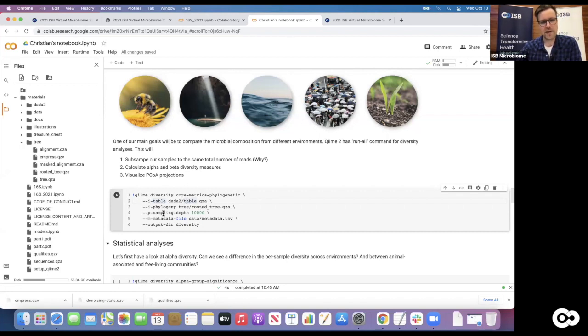And it will ask us for something like sampling depths, and that's a bit weird. That is related to the questions that people were asking in the chat. The one problem that we have is, if we look, for instance, at alpha diversity, let's assume we have one sample, and for some reason, something didn't go quite well in sequencing, and we got maybe only 100 reads for it. If I have a really low abundance organism, it's very unlikely it will actually be covered by those reads, right?